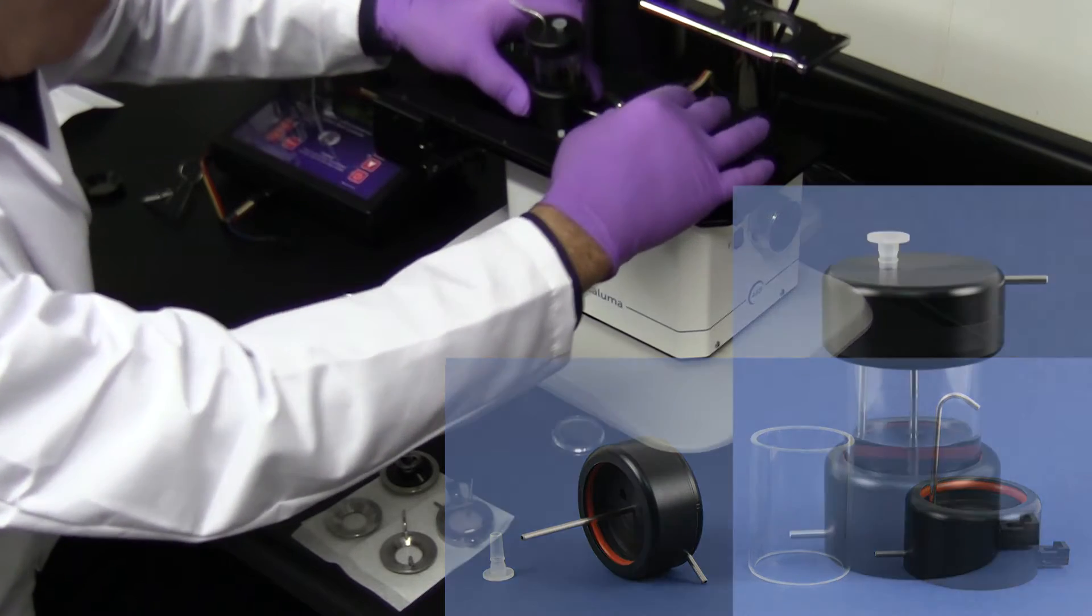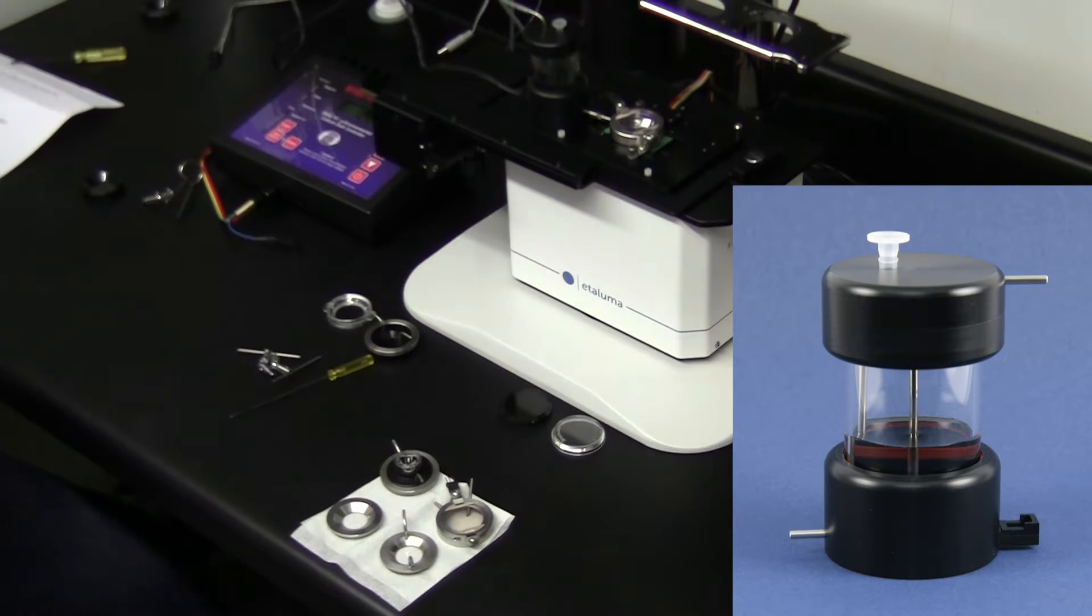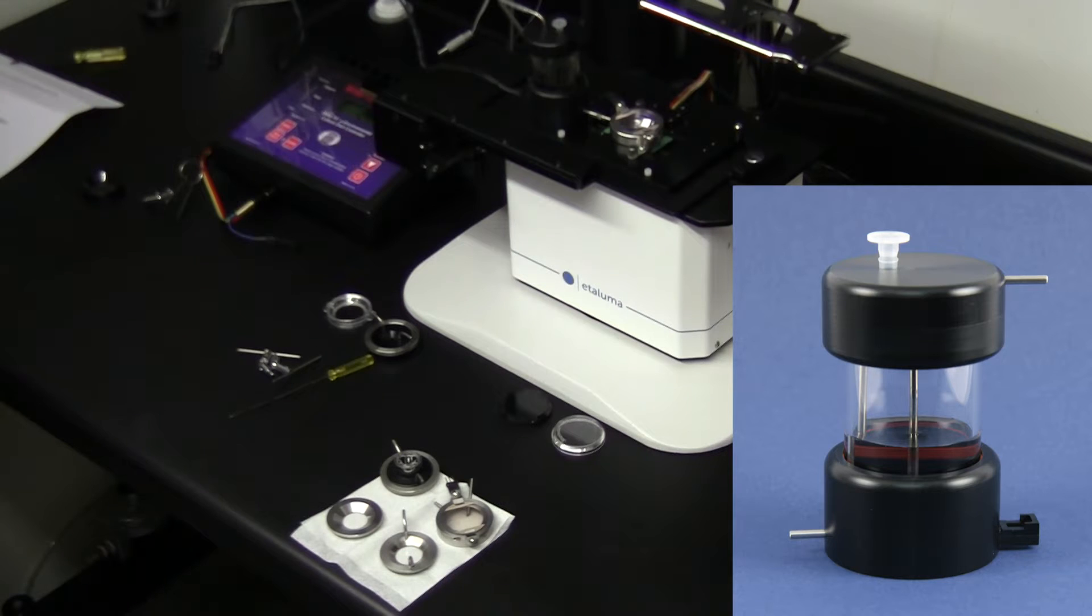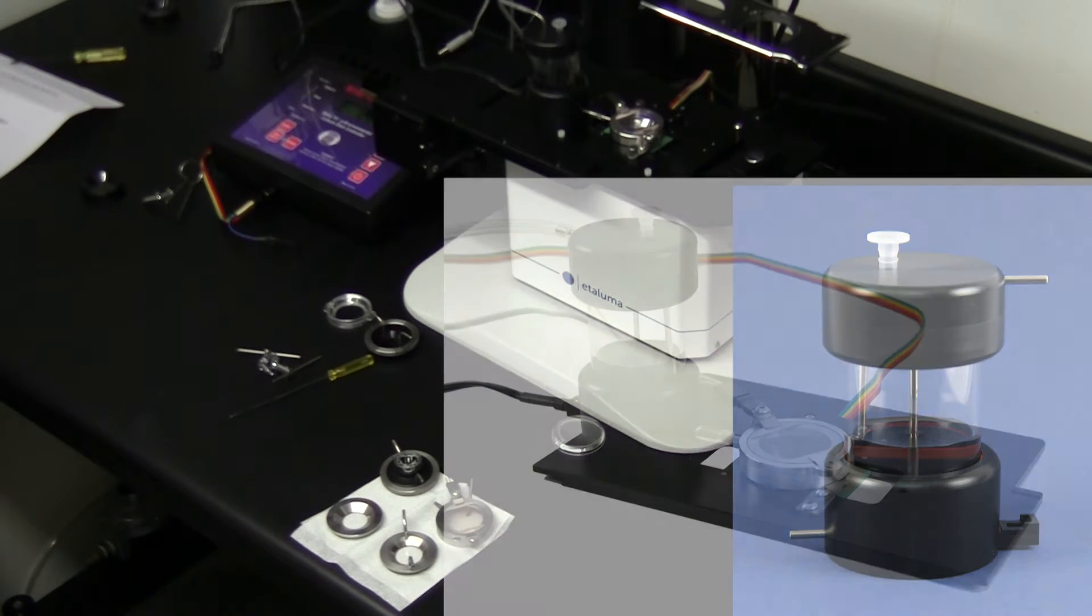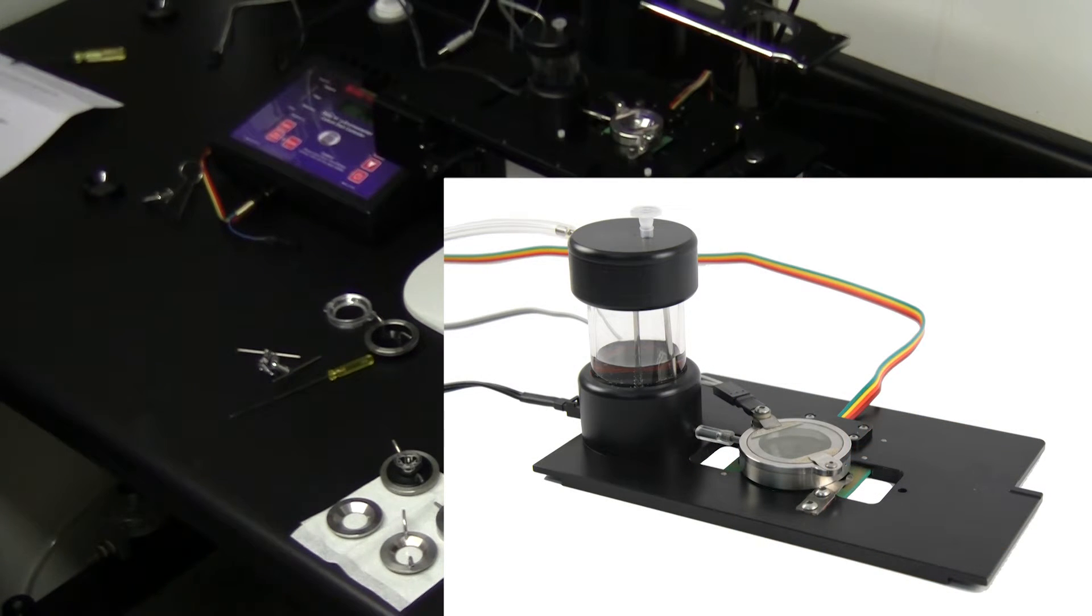It is a dependable, convenient accessory that provides weeks of humidification to Delta T environments. Gas is bubbled through heated water. The gas is then captured in the saturated airspace above the water and transferred back down through the heat source to be short-coupled to the heated lid so that the humidified gas does not recondense.